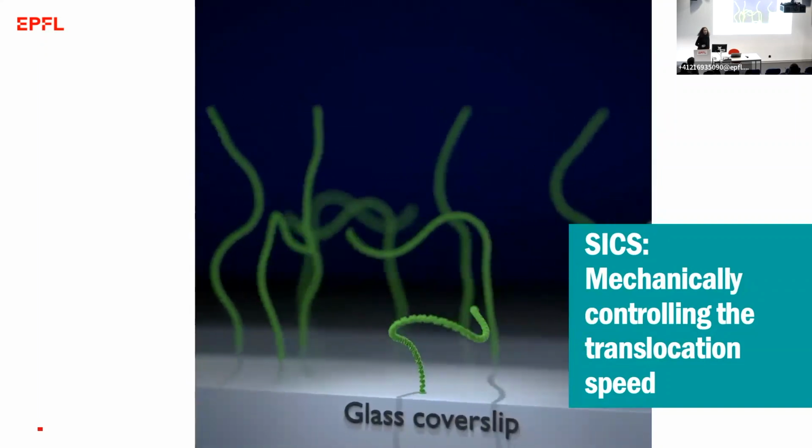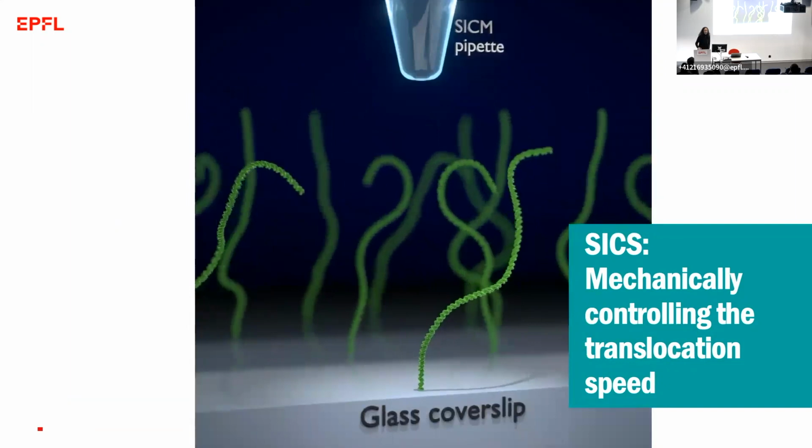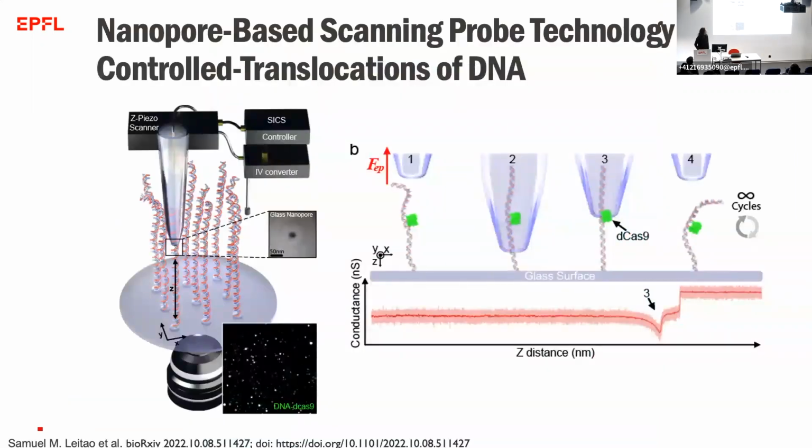So here we also have, all the time, millions of ions flowing, and now occasionally, when we want and where we want, we can also catch a single molecule. Just to showcase, the method is also compatible with physiological conditions. And as a first test sample, because our capillaries are tunable in size, we can make capillaries that can accommodate also DNA-protein complexes that are relatively larger.